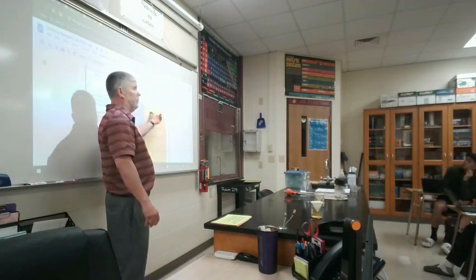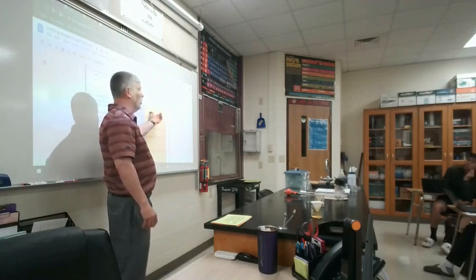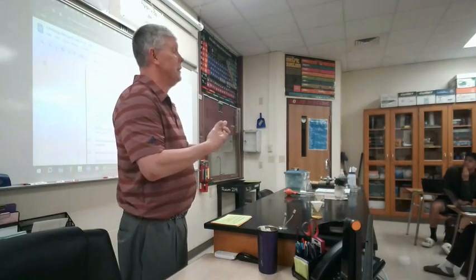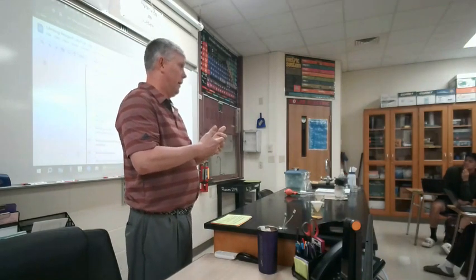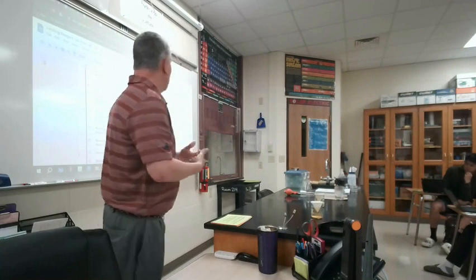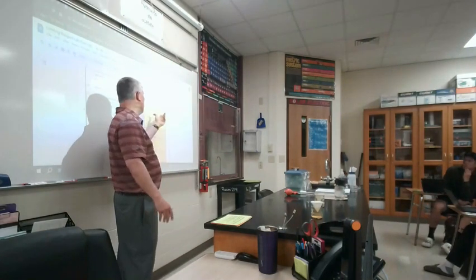You are going to begin with your volume of sodium iodide. Okay? You are going to begin with your volume of sodium iodide. Now, if you are working with somebody today who was not your partner yesterday, and you have a different volume than they did, okay, you are going to have to pick a volume based on the station that you work at.